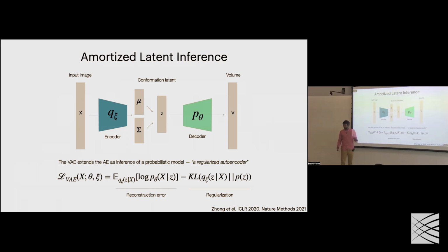One last point, just connecting this back to the classical reconstruction. Even though the architecture looks maybe quite different from the EM algorithm we discussed for homogeneous reconstruction, there actually do exist some deep connections. In the EM algorithm, the poses and the class assignments were also latent variables that we marginalized over by computing the full posterior. In the same regard, these conformation variables Z are also a form of latent variables. In general, it's much harder to compute the full posterior over these, right?